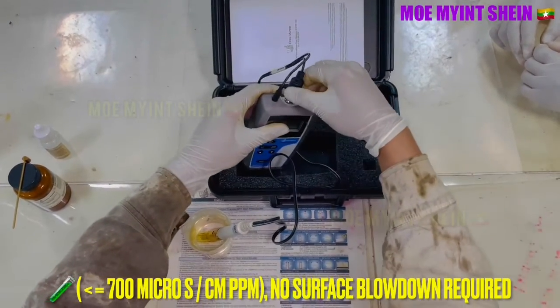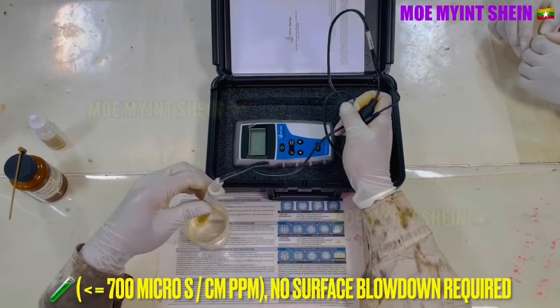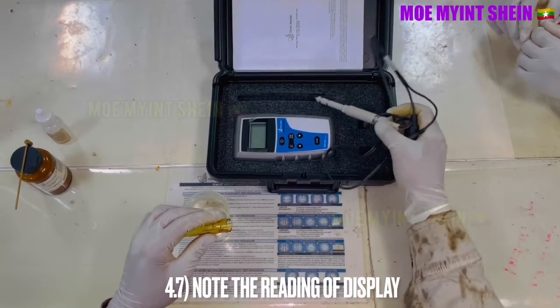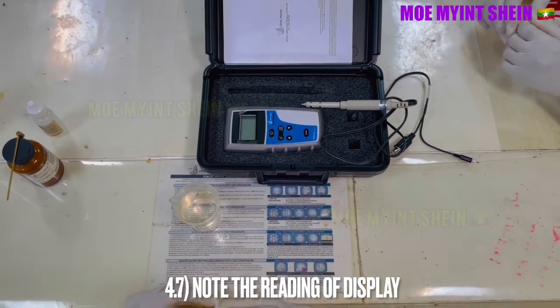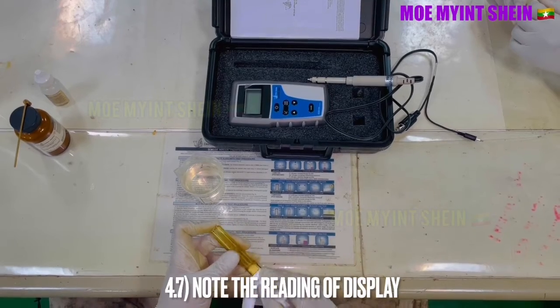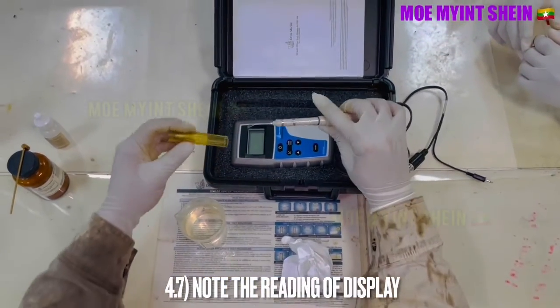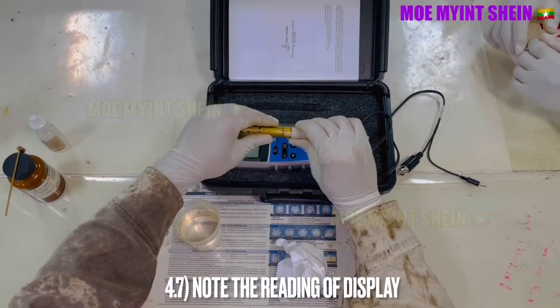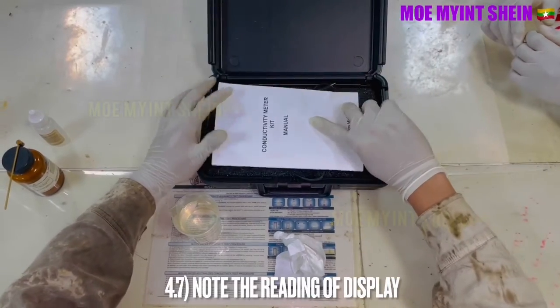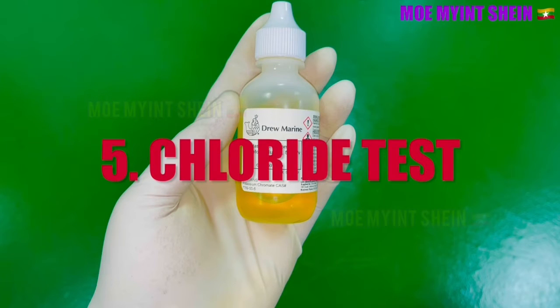If the reading shows less than 700 microsiemens per centimeter, no surface blow-down is required. Record the reading on the display.